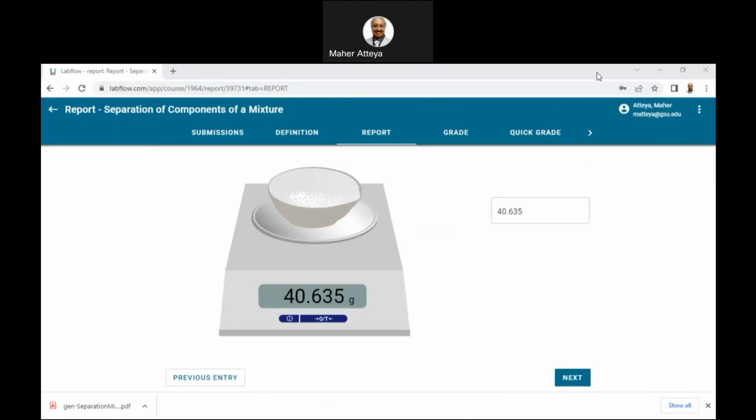Let me take another one because it has a problem. Let me take a picture of it because this one I have to take the mouse arrow out. It should not have the mouse arrow here. So, free of the mouse arrow. So this is copy.